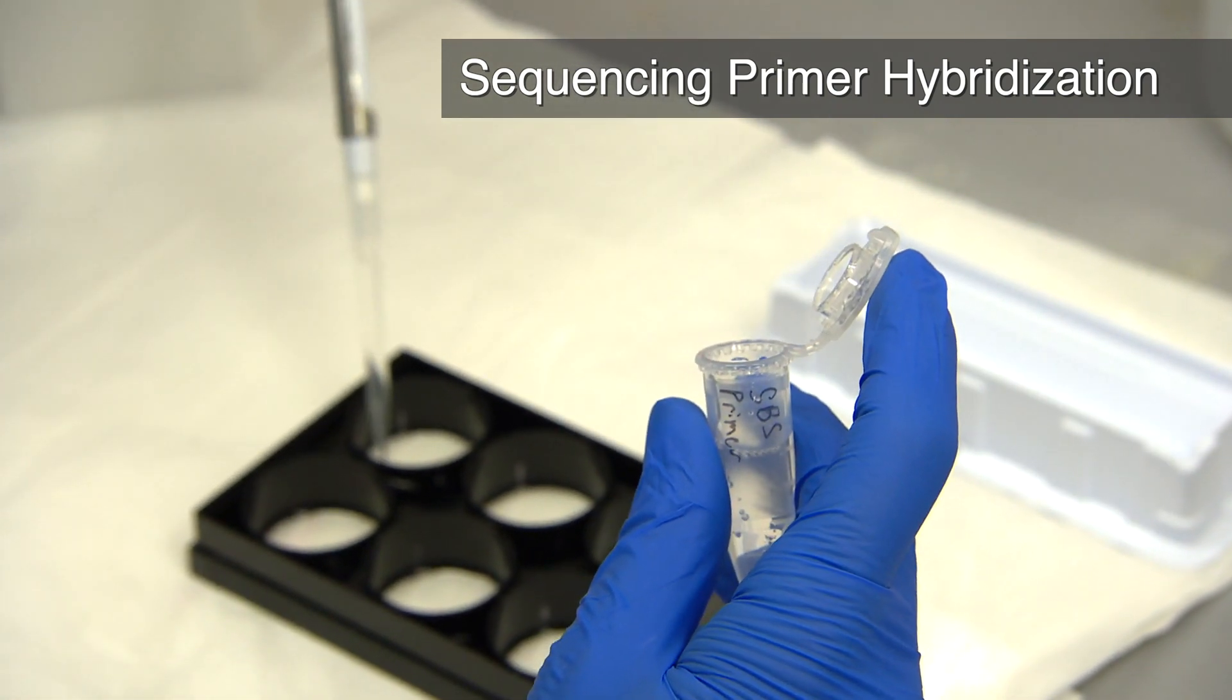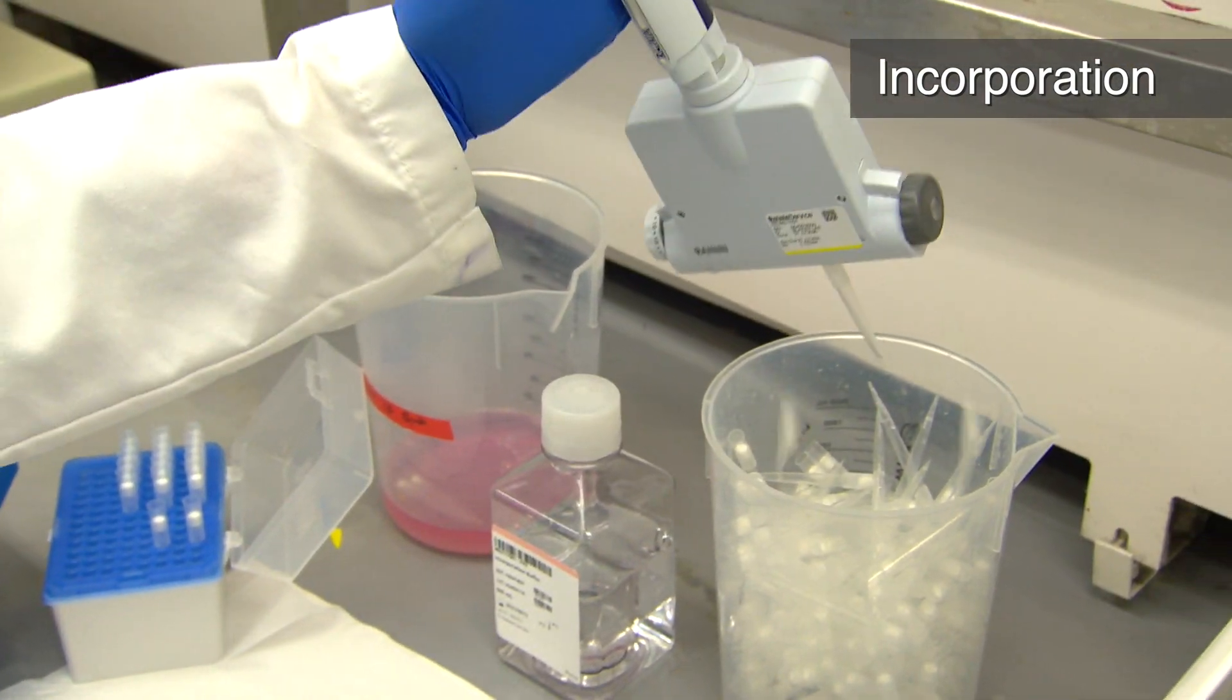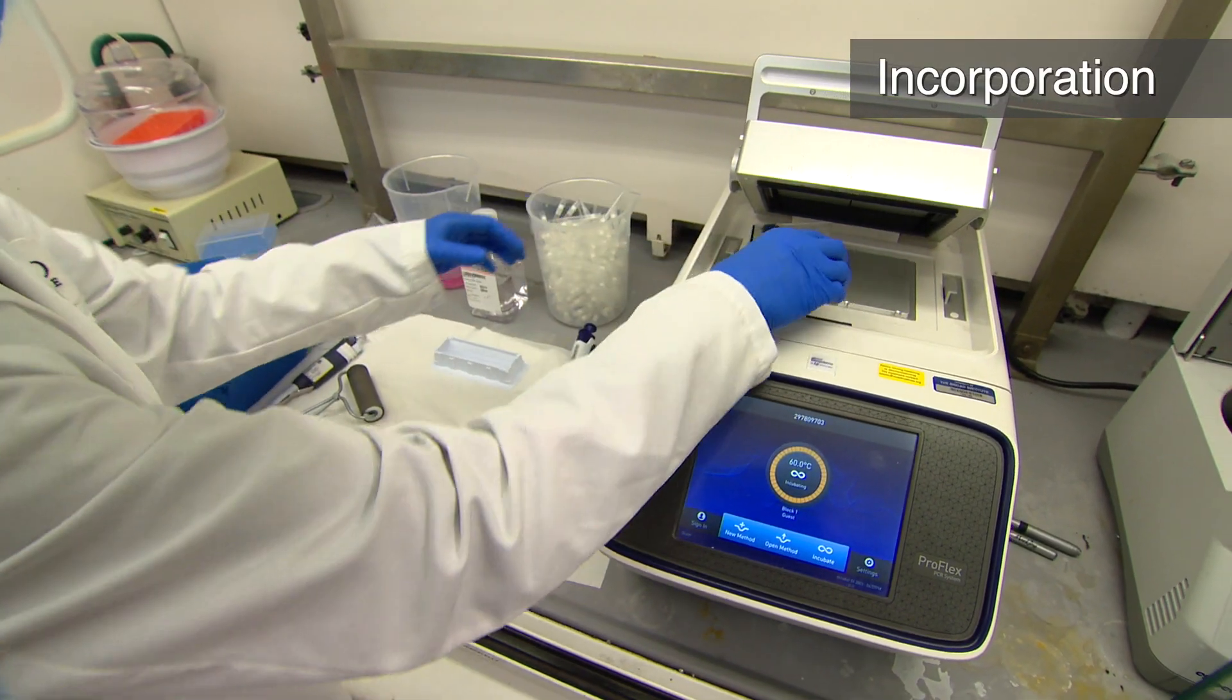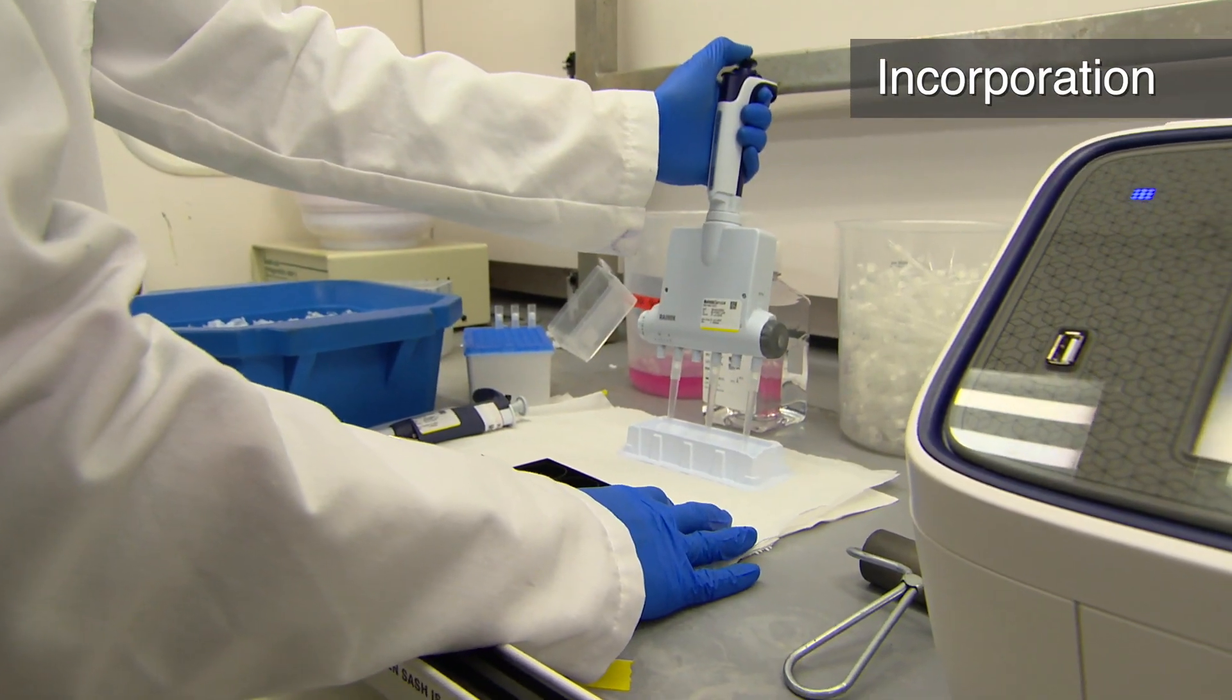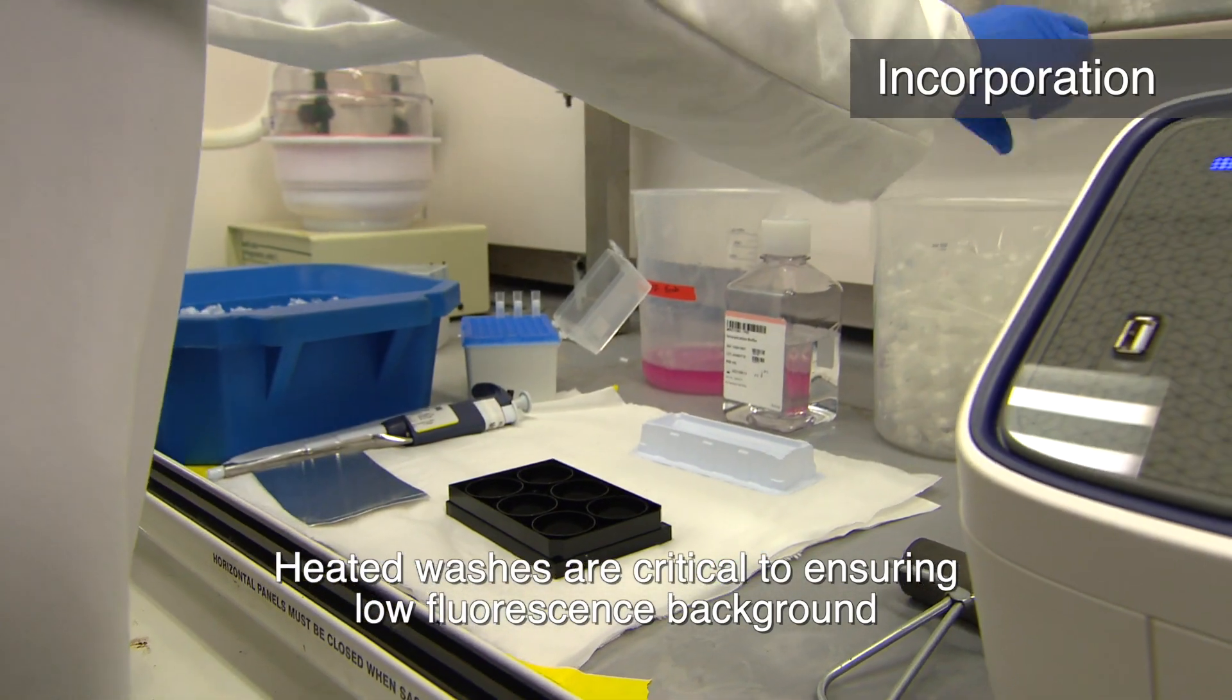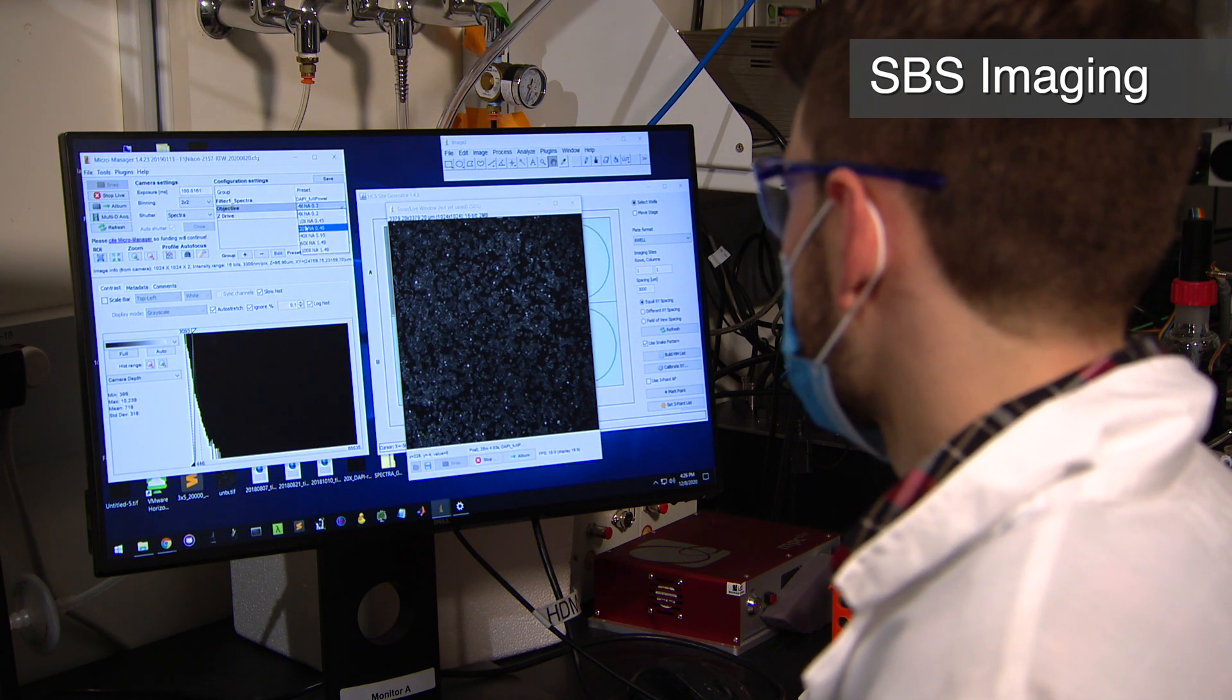Anneal a sequencing primer for 30 minutes at room temperature. Wash excess primer with Illumina PR-2 buffer 3 times. Thaw Illumina sequencing reagents and add 500 microliters of incorporation mix to each well and incubate for 5 minutes at 60C. Next, wash the plate with PR-2 6 times in quick succession. Then wash 5 times at 60C for 5 minutes each to minimize background fluorescence. After washing, stain the nuclei with DAPI solution and acquire the first cycle of sequencing data, carefully ensuring the sample alignment and image positions match the phenotypic data.